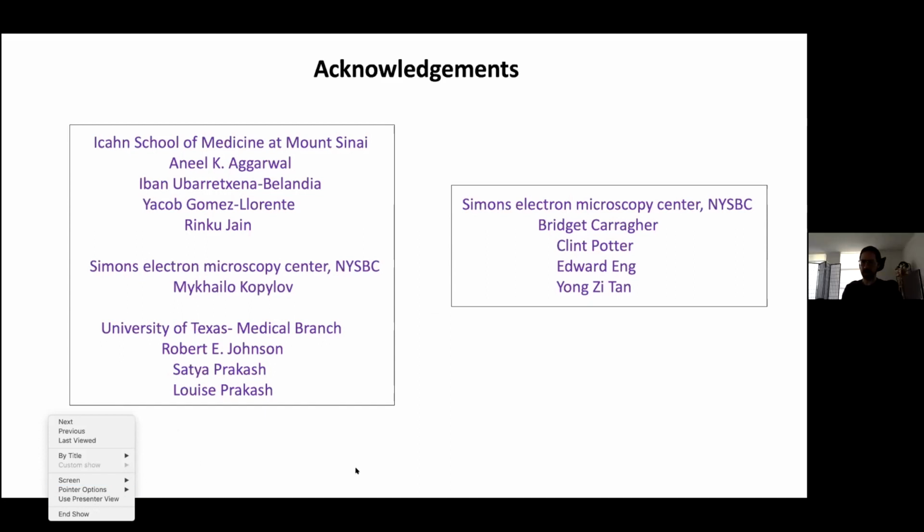Thank you. And a follow-up question for rigidity: is the rigidity a central feature of the Pol zeta polymerase and polymerases in general? Well, Pol-Z is very unique in the fact that it's the only multi-subunit TLS polymerase, first of its kind.